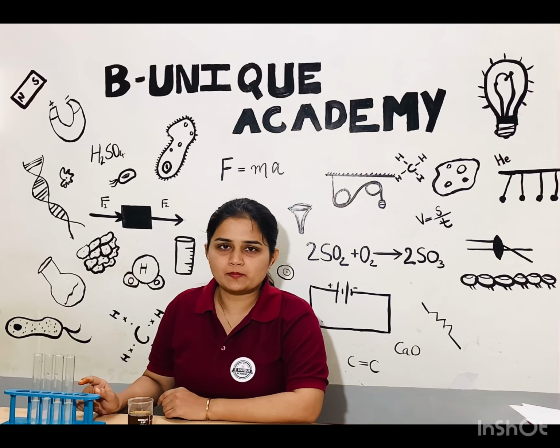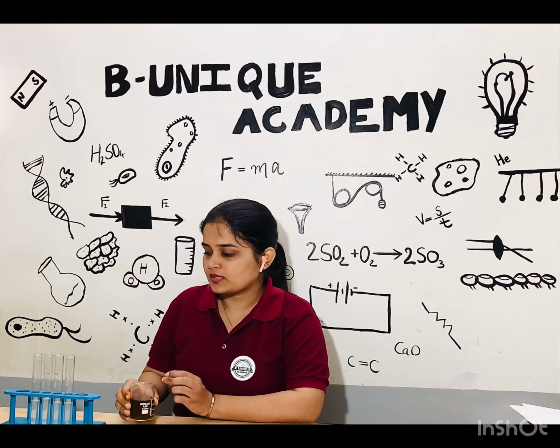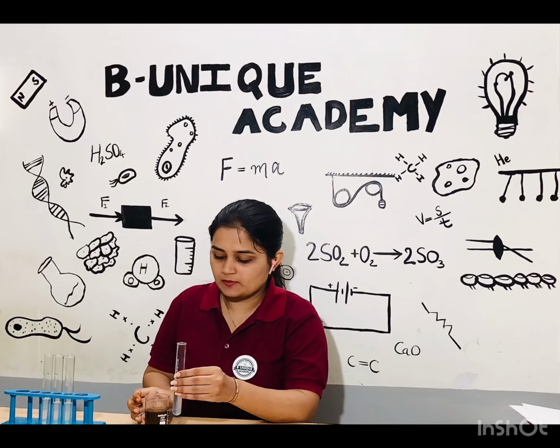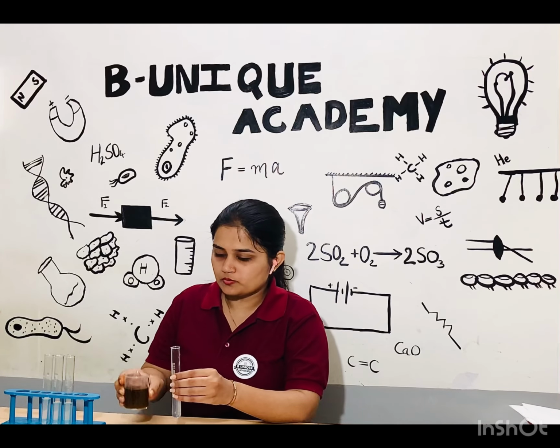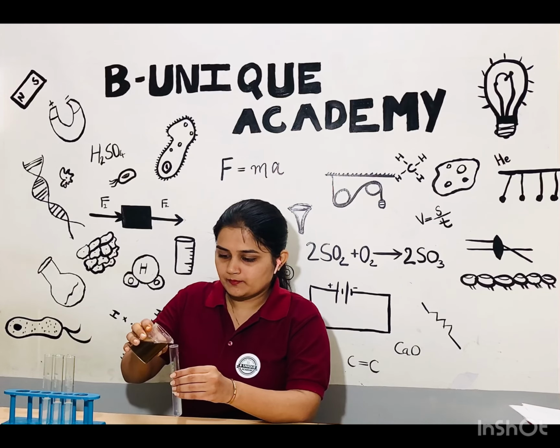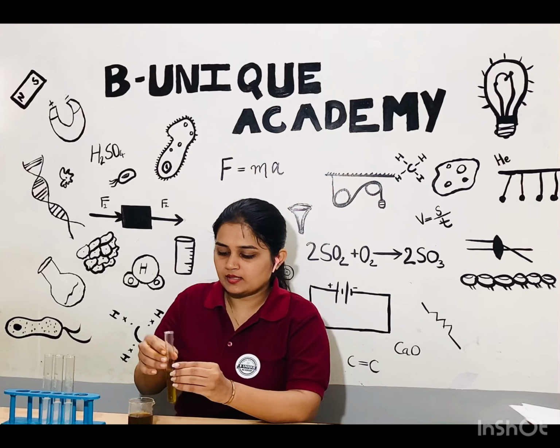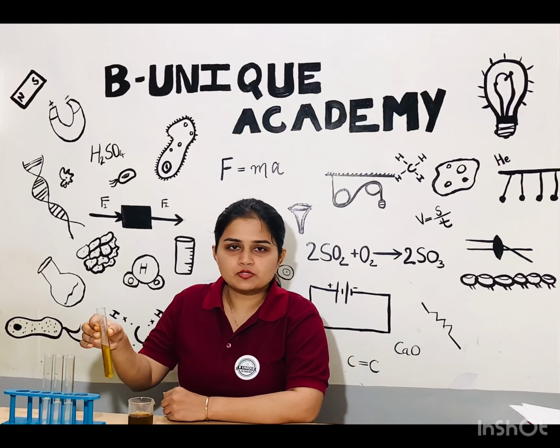The procedure for the practical is I am going to take a test tube filled with 50 ml water in which I am going to add colored solution 10 ml. Is it clearly observed that the solution turned to orange color?